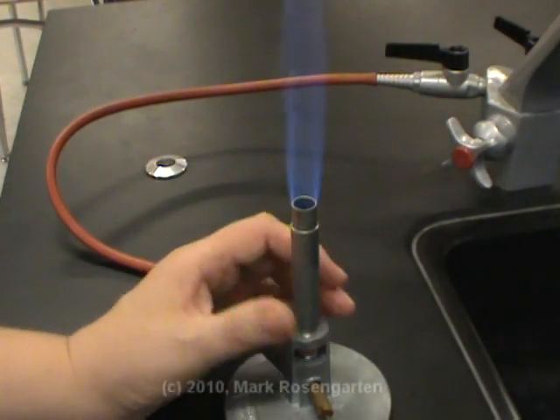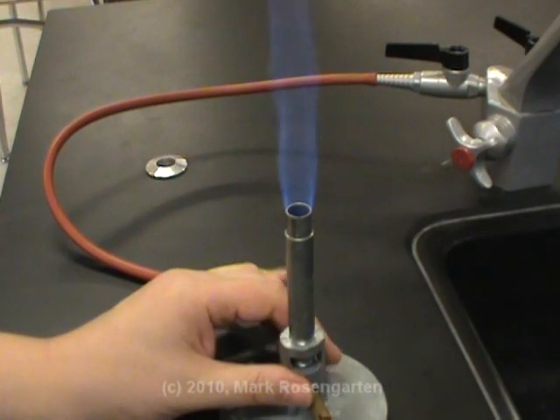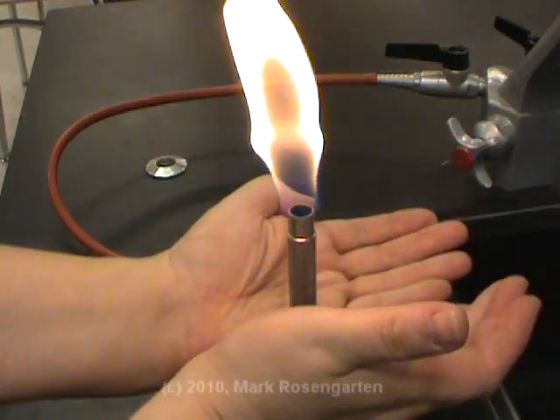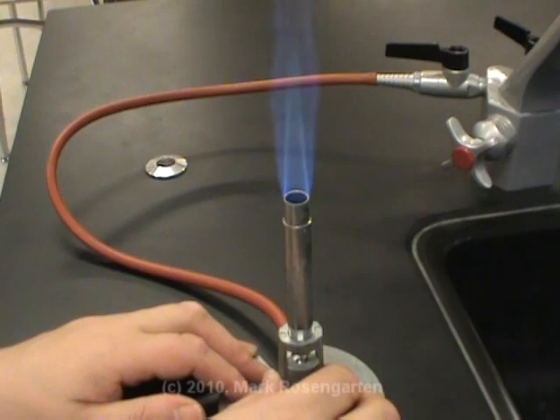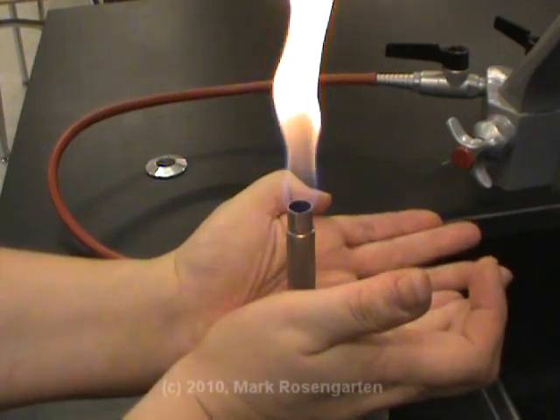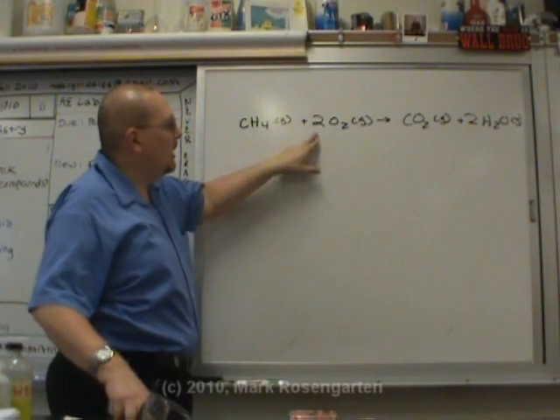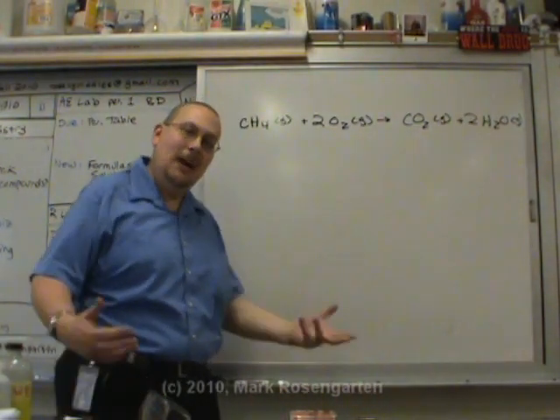Let's open this up again. Now we have the perfect stoichiometric ratio of oxygen to methane. Too little air, you get incomplete burning. Too much air, you get a whoosh — I call this the whooshing flame of death. And I call this Oz the great and terrible. When you burn methane in oxygen, you get carbon dioxide and water vapor in a reaction that we call combustion.